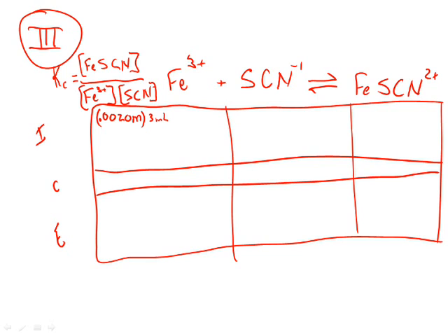But we're actually going to dilute it, right? Because we're mixing it with some other things. So we're going to dilute it to, is it 10 milliliters altogether? If you add up all the milliliters across that row, how many milliliters? Is it 10? So we want to find our final concentration when we've diluted this to 10 milliliters.